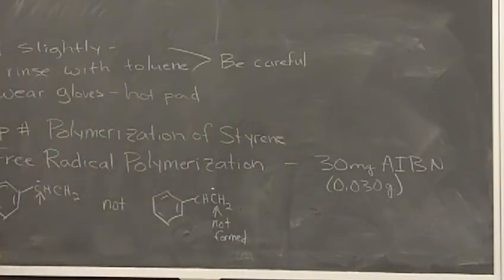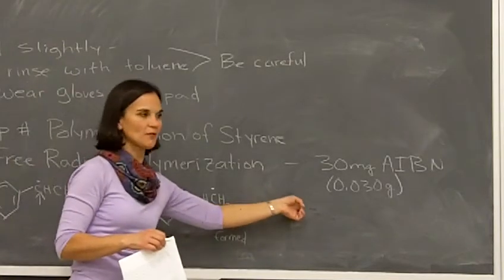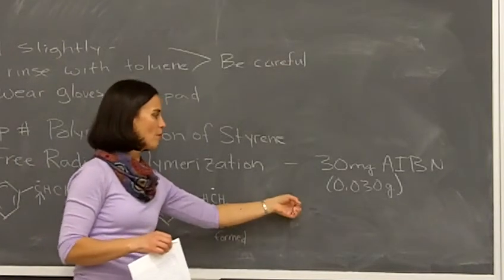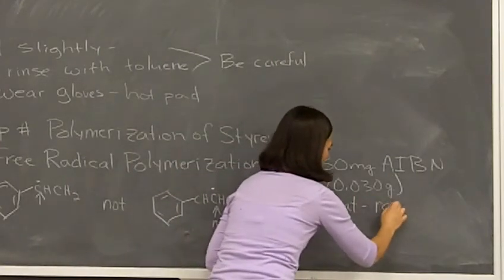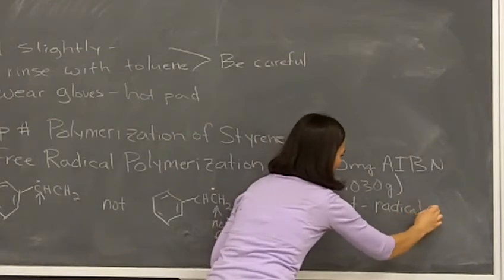Just like the benzoyl peroxide, it forms radicals, so it's a very reactive substance. We keep it in the freezer like the benzoyl peroxide. You've got to be careful handling it. We don't want to let it sit out. Once everybody's done using it, we'll put it back in the freezer. And just like with benzoyl peroxide, you don't want it on glass joints. You don't want to grind it or anything because it is really reactive. So you don't want to prompt it to react on you before you're ready, okay? But with the heat, we will get the radicals formed from the AIBN, okay?